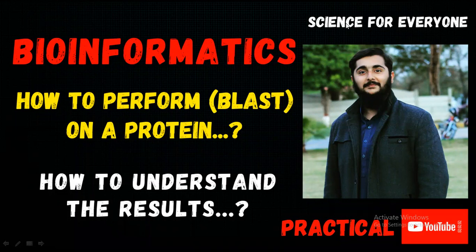Today in this video, I will perform a very important practical related to bioinformatics. The title of the practical is how to perform BLAST on a protein. After that, I will tell you how to understand the results.